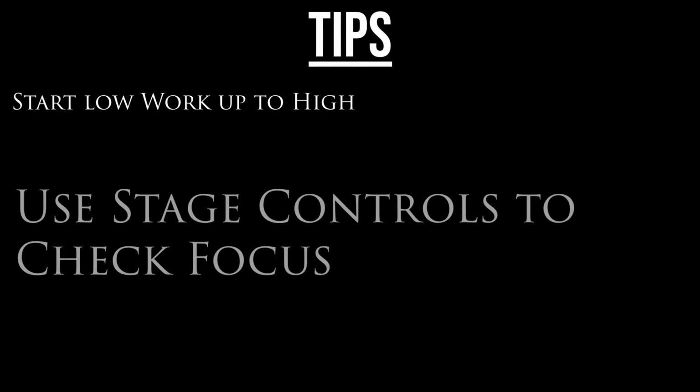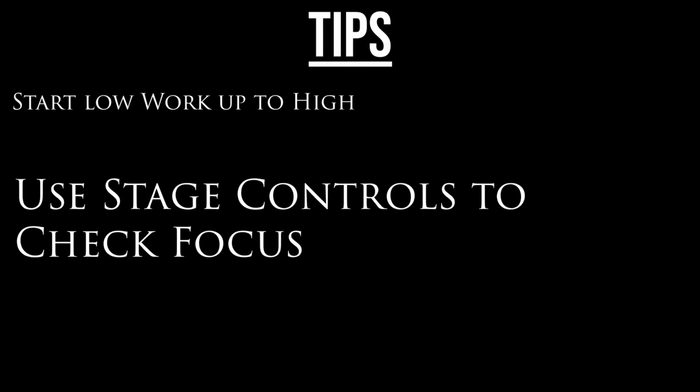When you think you have something in focus, you can check by using the stage controls to move the slide slightly. When you do this, the image should also move. You can then use the fine focus knob to get the best image possible.